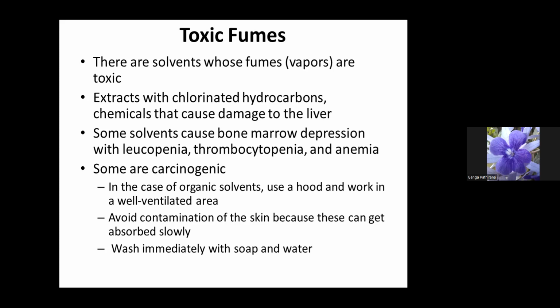In the case of organic solvents, when you are handling the organic solvent, you have to use the hood and work in a well-ventilated area. You have to avoid contamination of the skin because these can get absorbed slowly via the skin. And you have to wash immediately with soap and water if there is a contamination.